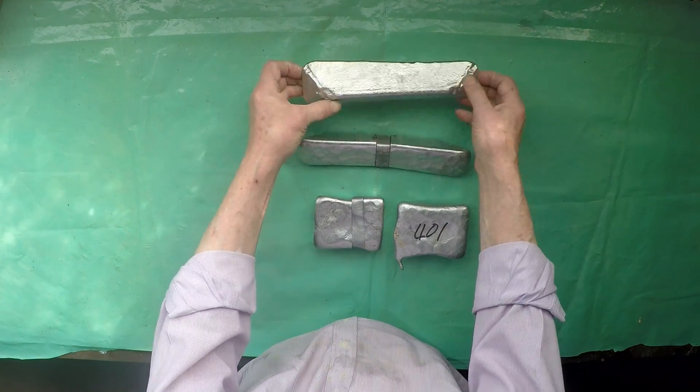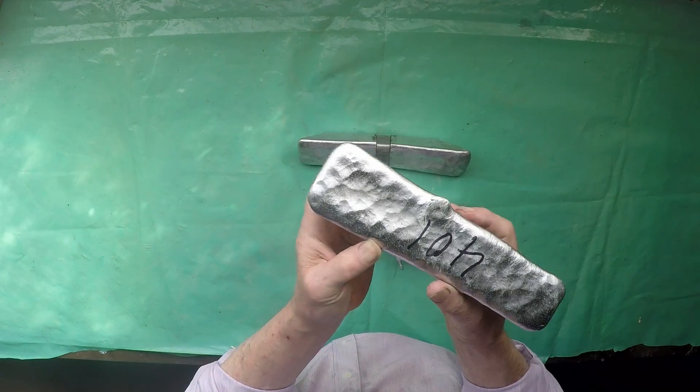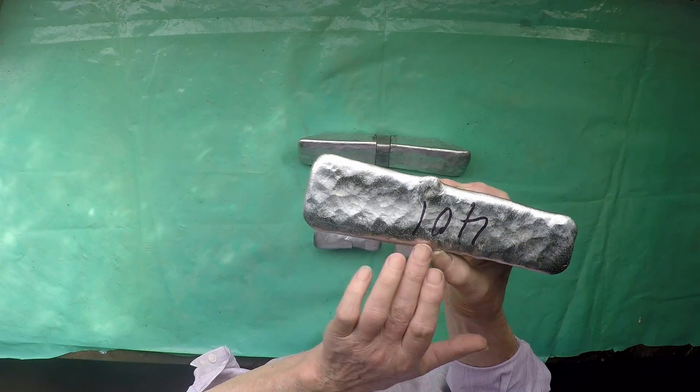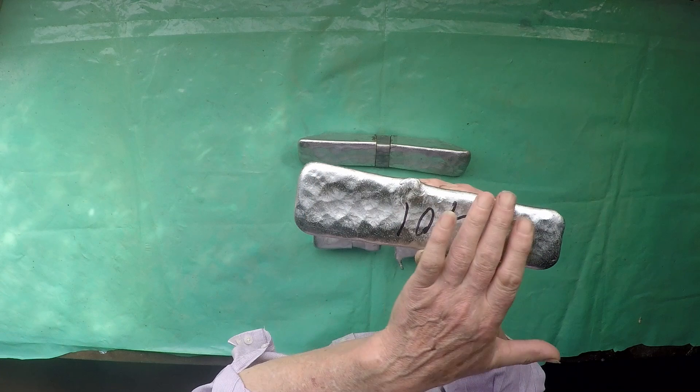But this is what I got and you can see these bumps, little bumps all over this and in fact they're quite rough.